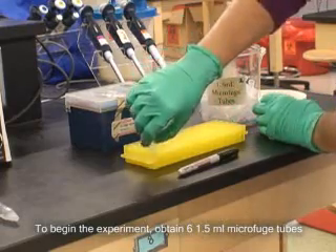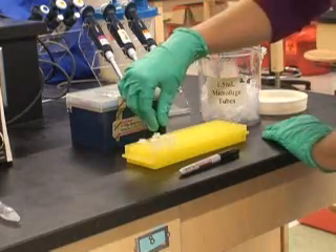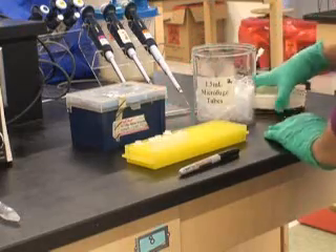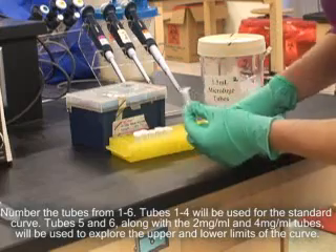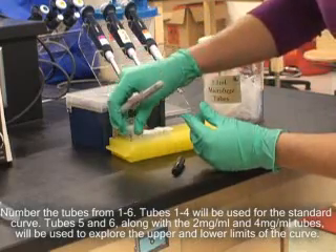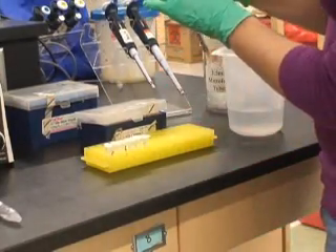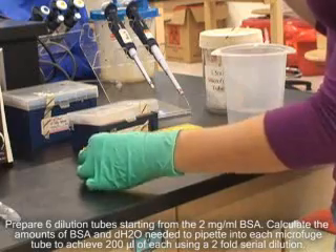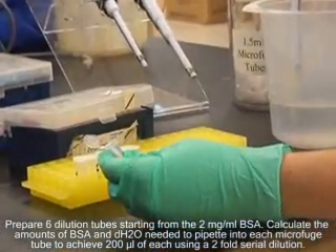To begin the experiment, obtain six 1.5 milliliter microfuge tubes. Number the tubes from 1 to 6. Tubes 1 through 4 will be used for the standard curve. Tubes 5 and 6, along with the 2 milligram per ml and 4 milligram per ml tubes, will be used to explore the upper and lower limits of the curve. Prepare six dilution tubes starting from 2 milligram per ml BSA. Calculate the amounts of BSA and distilled water needed to pipette into each microfuge tube to achieve 200 microliters of each using a two-fold serial dilution.